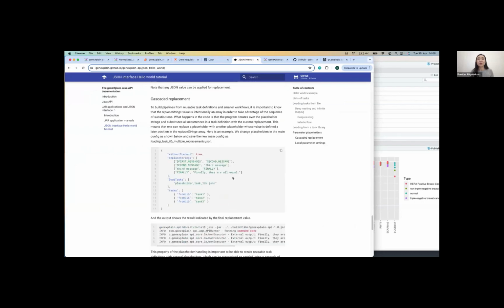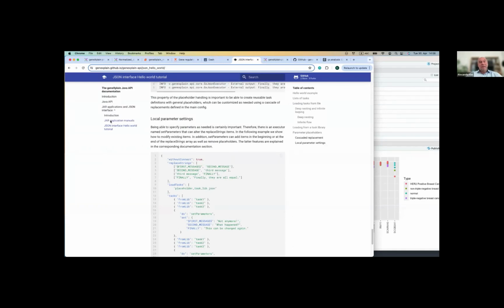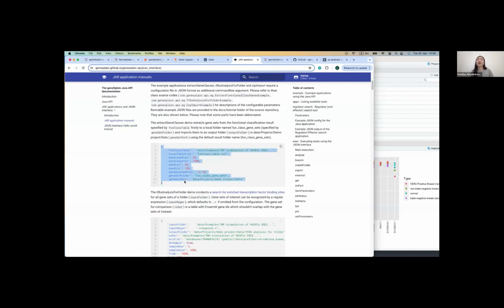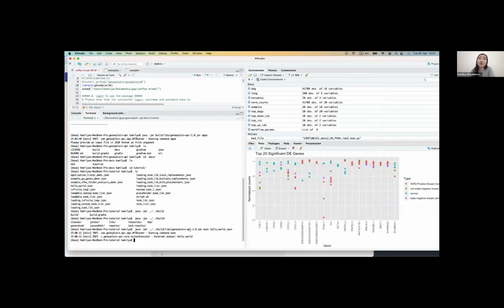We have a lot of possibilities. Just an example of the parameters: in the same way you define the workflow, define the inputs, and then run this command with the given JSON. So this is just another way of using the geneXplain API, if you want to use it as a command line tool, not inside some script.